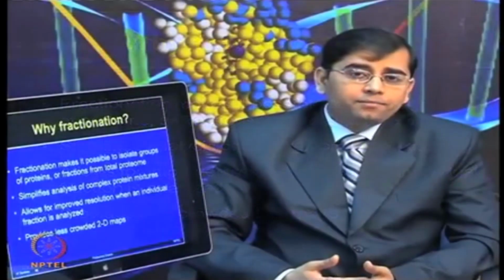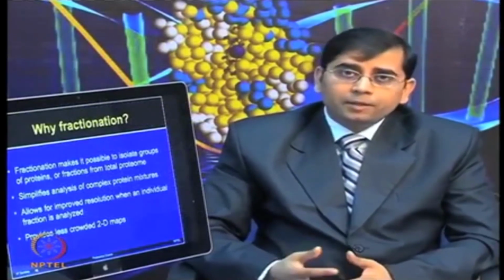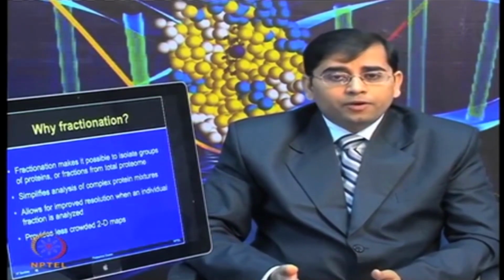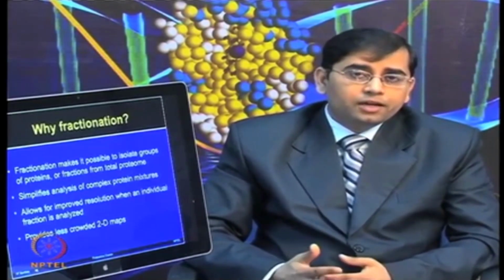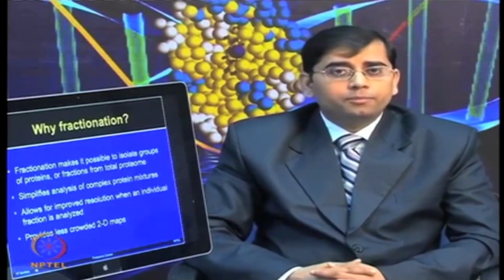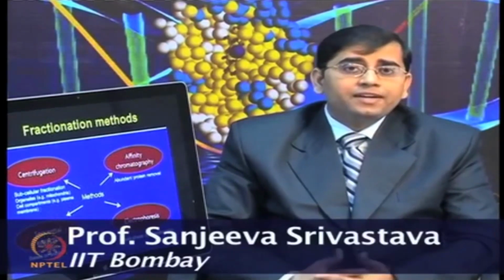When you apply your protein samples on a 2D gel or other gel-based proteomic techniques, this will provide you a less crowded protein map. So, again, fractionation can serve a good need in both gel-based and gel-free proteomic applications. Let us talk about the different types of fractionation methods available.